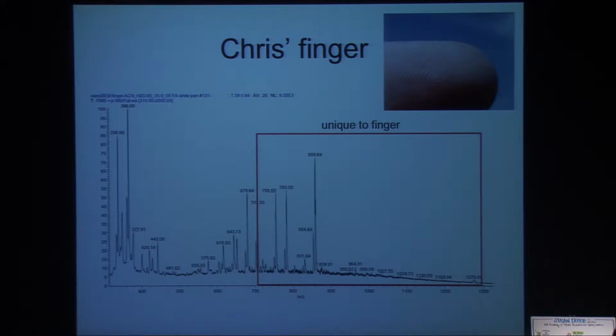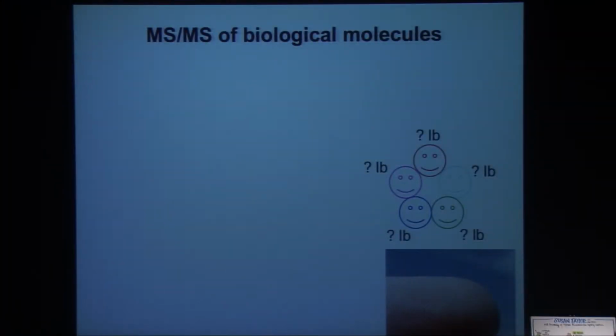Now, this doesn't give you any insight in terms of the molecules. One of the things that you can do by mass spectrometry is break the molecules apart in the gas phase. All the masses that you saw, you're going to break them apart, and in principle, the chemistry dictates how these molecules fall apart. Can we use that to our advantage to begin creating some sort of Google Map style view, to begin annotating and taking an inventory of the molecules?